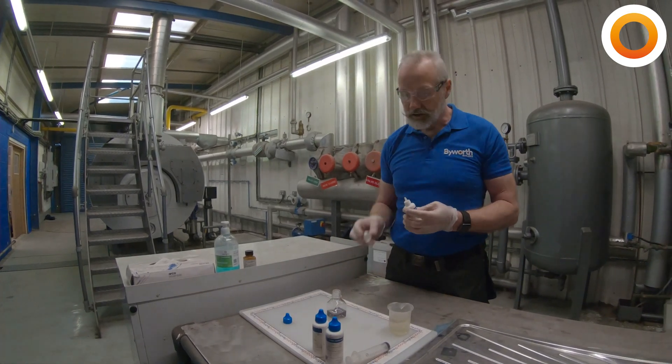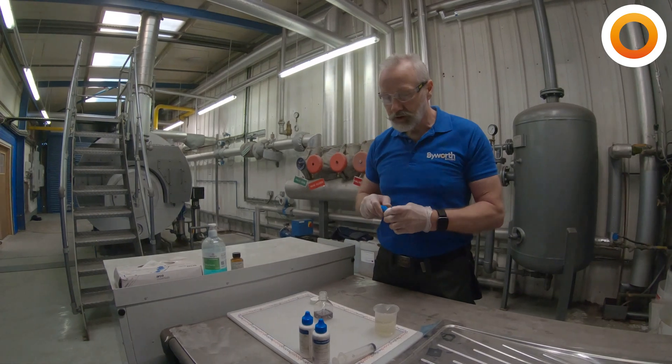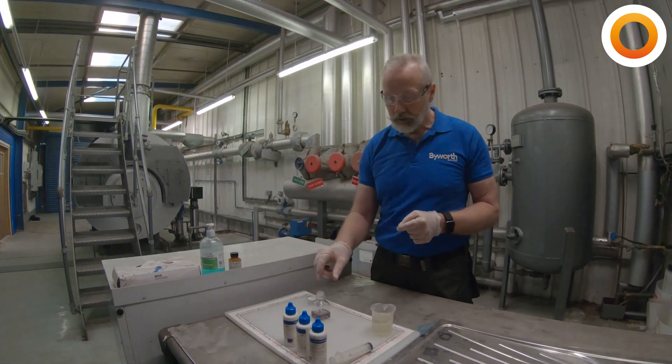And that's how easy it is to check the water quality coming out of the softener.